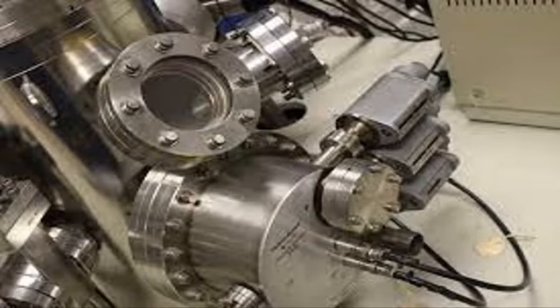Dear student, Auger electron spectroscopy is a very in-depth characterization technique. You can use it in a broad manner for analyzing the material surface, for composition and elemental analysis of the material surface at a depth of 3 to 10 nanometers.